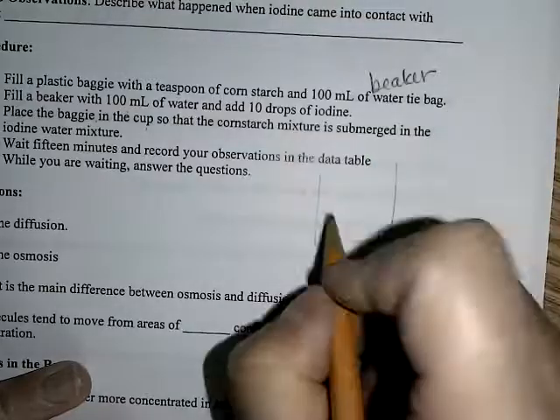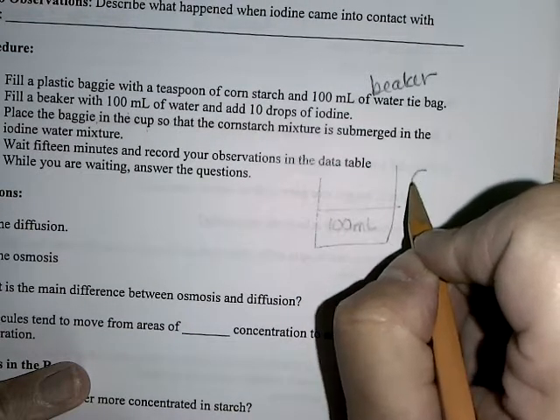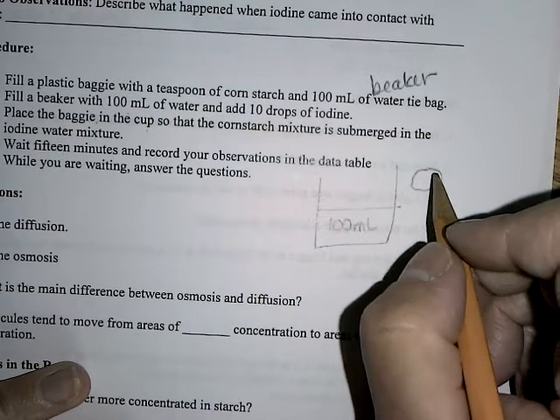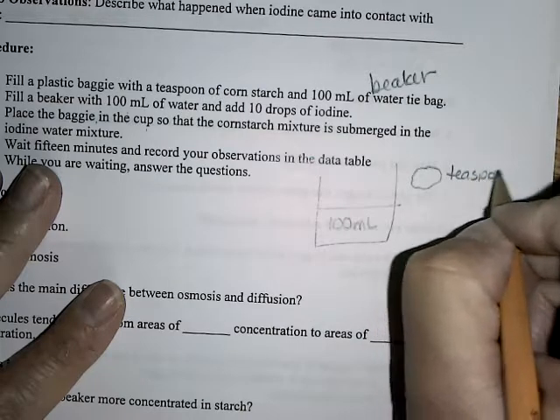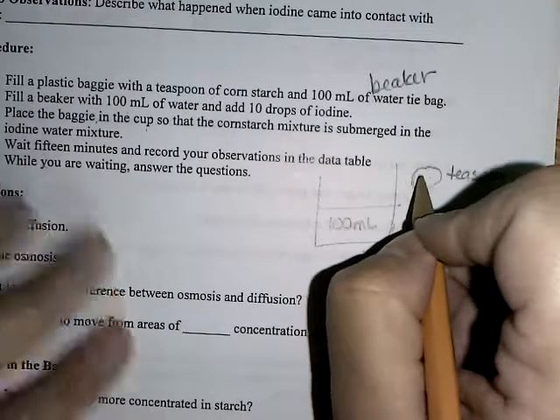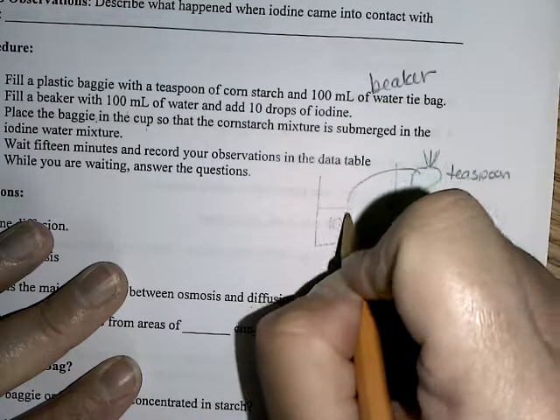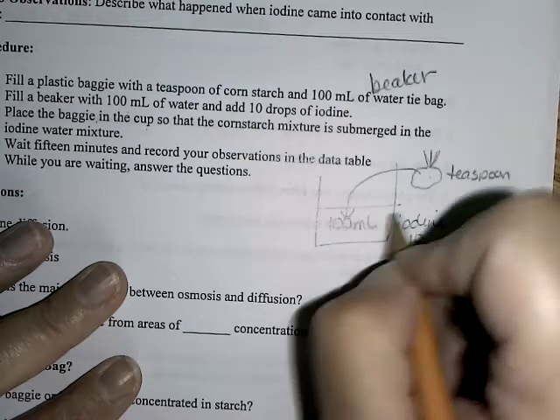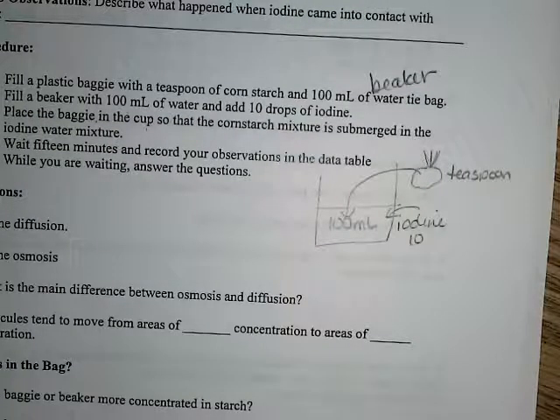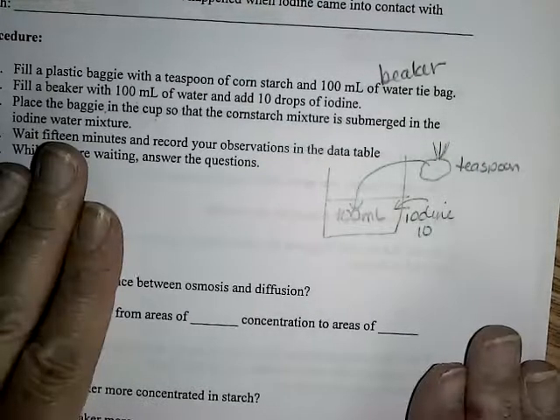Okay, so basically your lab is you're getting a beaker, 100 mils of water, okay? You're getting a baggie, you're putting, how much cornstarch? Just a teaspoon of cornstarch, and then you're going to seal up the baggie, right? You're going to put that baggie into the iodine. You're going to put 10 drops of iodine in the water, and then you're going to wait and watch and see what happens. Okay? This is not as hard as what you think.